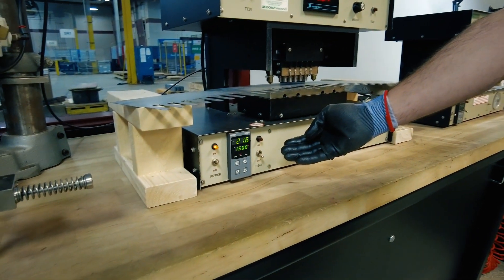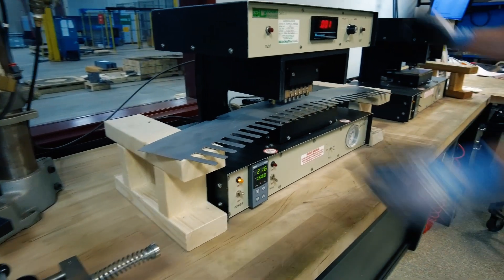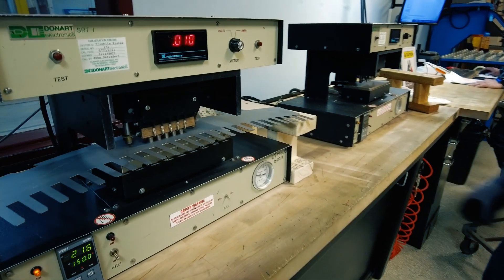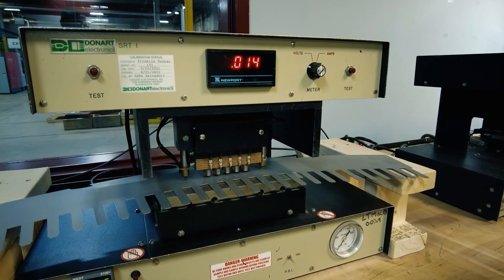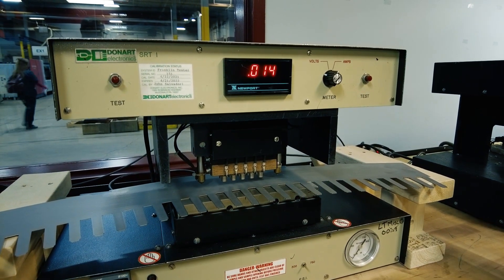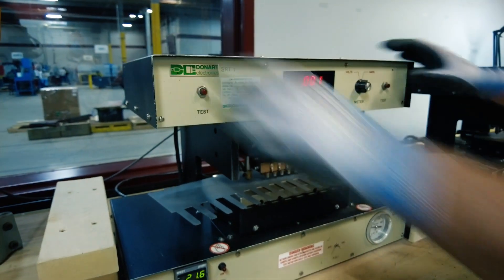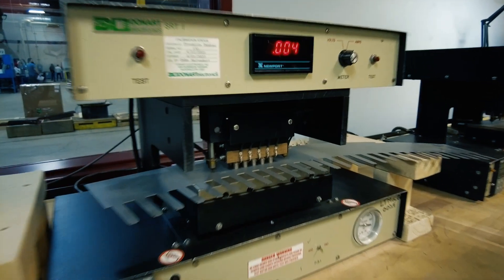We also have the ability to change the temperature and do elevated or room temperature tests. The way the test works: simply load the specimen and start testing, and that'll give us a reading here in amperage. The lower the value, the better the resistance. We'll take multiple readings on sample material as well as recoated material, performed at Laser Technologies.